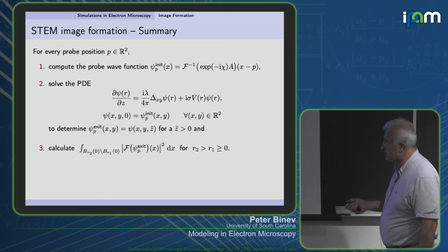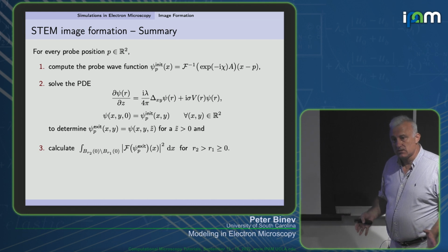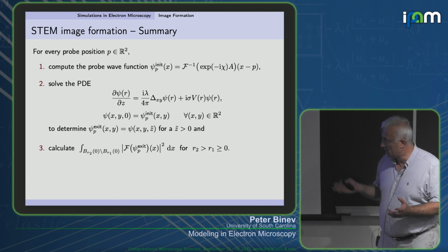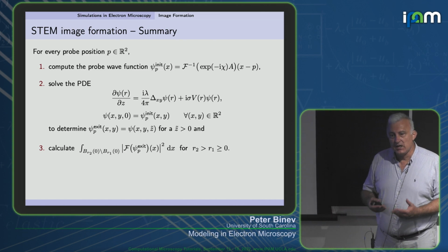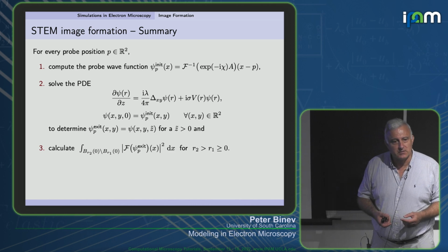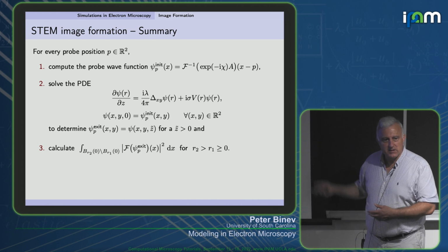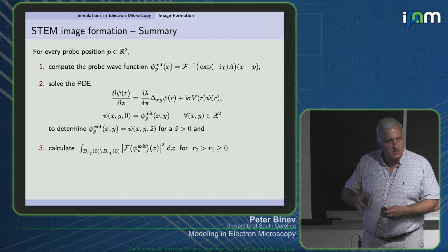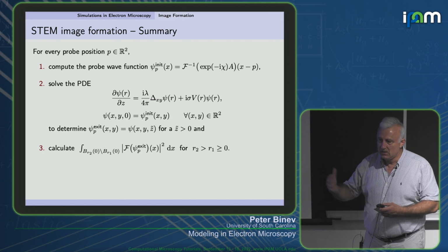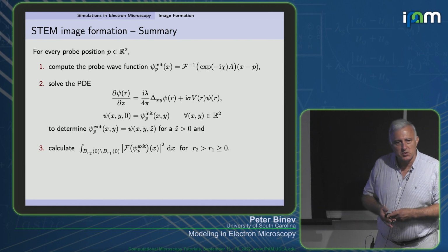And now the basic thing is how to solve this equation. So there are methods, especially since this problem was considered in the 60s. At that point, the only method to solve it was the Euler method. I mean, the only way people were considering this type of equation to be solved is just progression in the z direction, which was considered the time variable, and then step by step calculating the approximations.